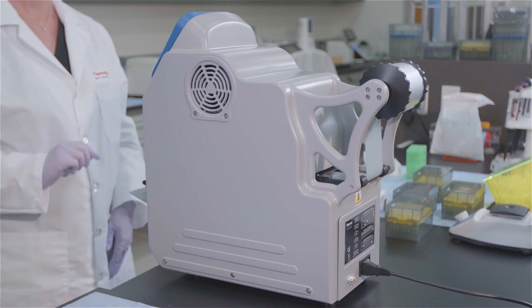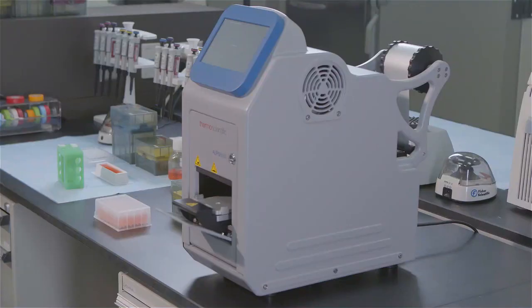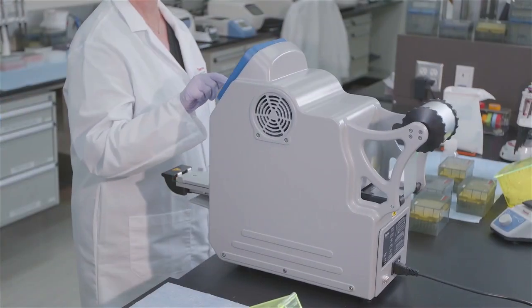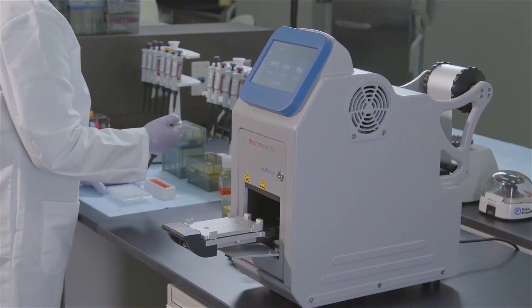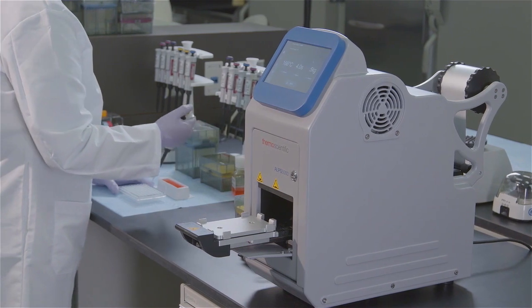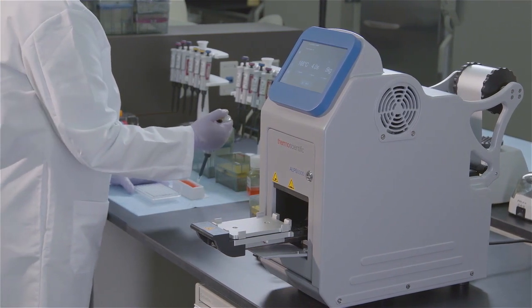With fully mechanical, energy efficient operation, user friendly features and cutting edge process customization, the ALPS 5000 automated plate sealer is the next generation in heat sealing equipment for your lab.